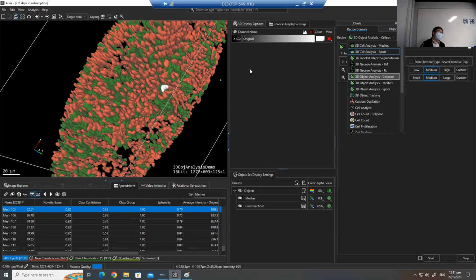Cell analysis, either 2D or 3D, is different from 2D object detection or 3D object detection. In cell analysis, you can count the different vesicles within the cell and try to find a relationship, or the distance, let's say between the membrane, the nucleus, and the cytoplasm, and whether they have any colocalization. In 3D object detection, you don't have this kind of data. But if you want to find the relationship between multiple channels, you need to use 2D or 3D cell analysis. They're different. It supports multi-channel. So we'll cover a bit more in the afternoon.